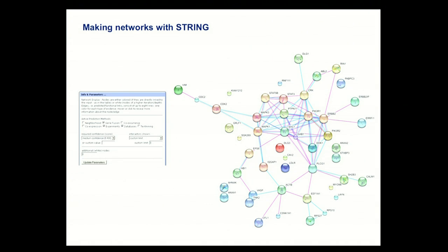Again, you may consider it an advantage or a drawback that these are not protein-protein interactions. I think that depends completely on what you want to do. Of course, I would presume there is more coverage in these data types because you can draw on many complementary functional association data. But I would say a challenge is to actually interpret them. If you see this kind of network and half of it is based on gene expression correlations and the other half on genomic context data, I wouldn't know specifically which experiment to carry out to functionally test this network.